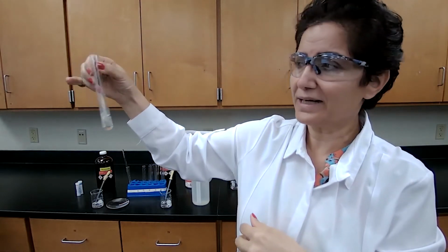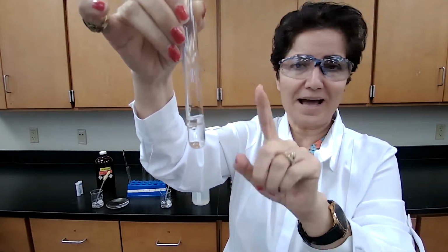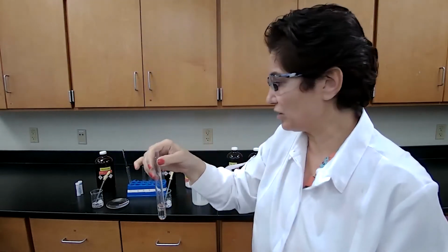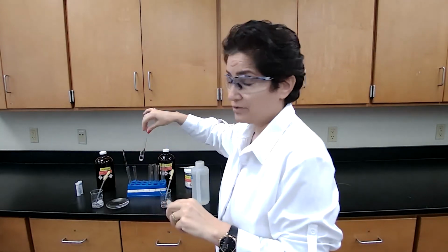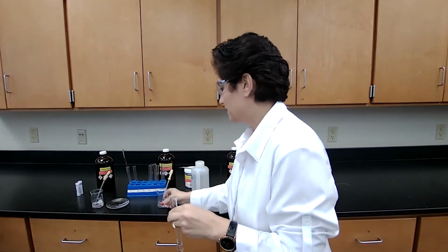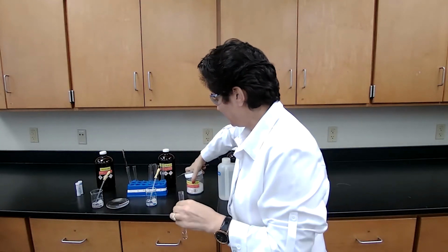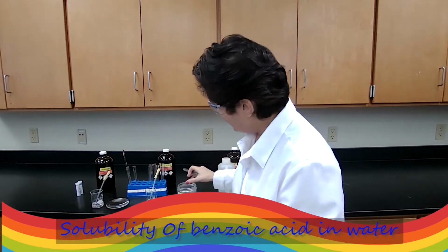But if it's 2 layers and you shake it vigorously and you hold it, still it shows the 2 layers. Same thing happens with the oil and vinegar salad dressing, not soluble. So the compound is not soluble, and I don't have to test for the pH. I would only test with the litmus paper if the sample is soluble.